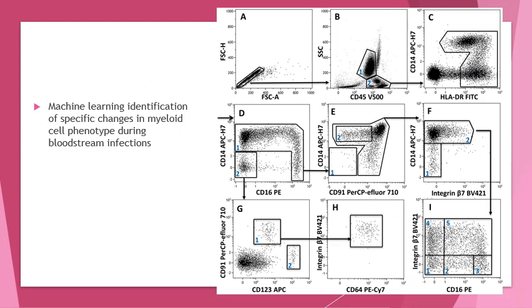Here's another article, another gating strategy. So they use forward scatter height and forward scatter area. They started with isolating out their single cells. So these are your singlets, and then these are all your doublets. And then from there, they did side scatter versus your CD45 V500. And then they gated out their lymphocytes and their monocytes. So 2 is monocytes, and then these are most commonly probably your lymphocytes, and these are probably granulocytes here. This is probably just some debris.